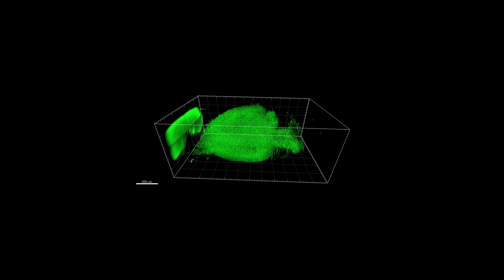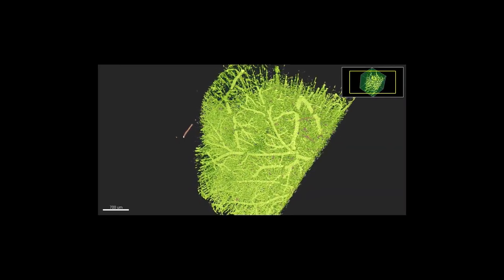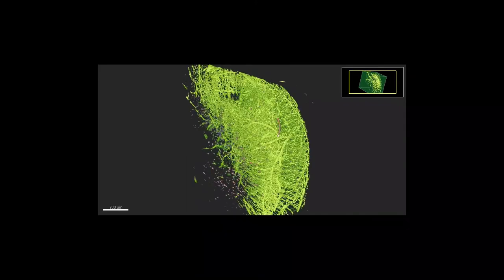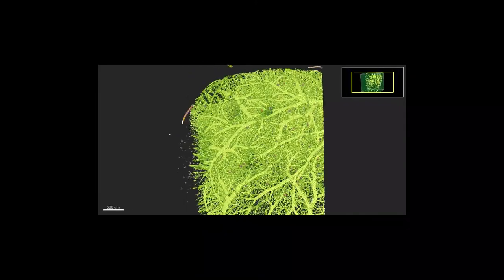For example, here we are looking at a transgenic mouse that expresses GFP in endothelial cells, so now we can visualize every single capillary, and the vein, and artery, the entire vascular tree of the mouse brain.